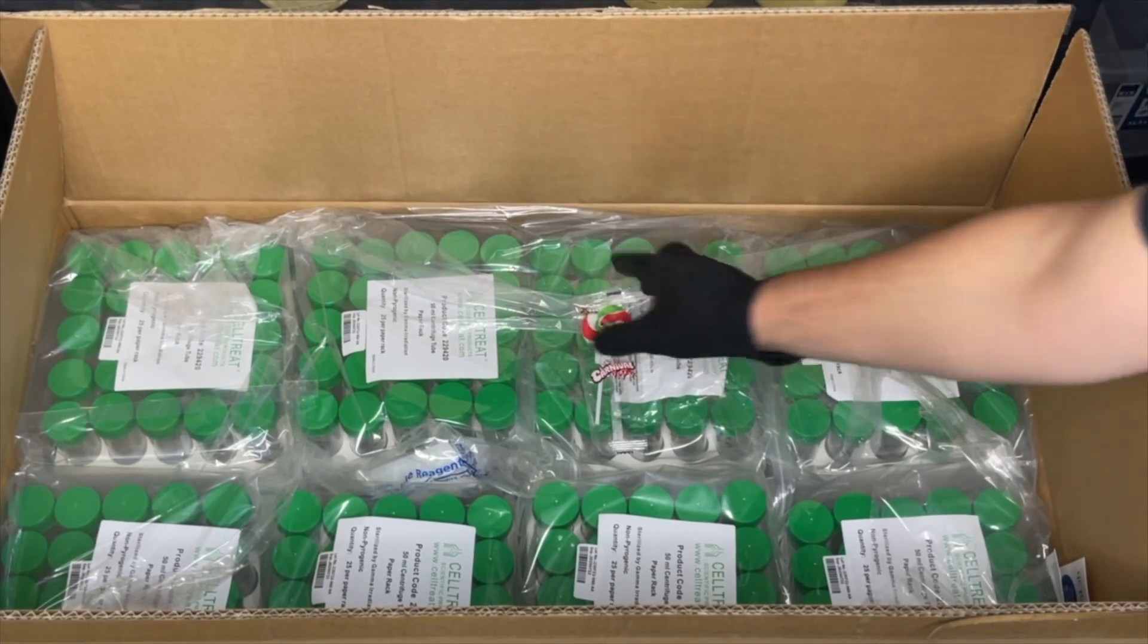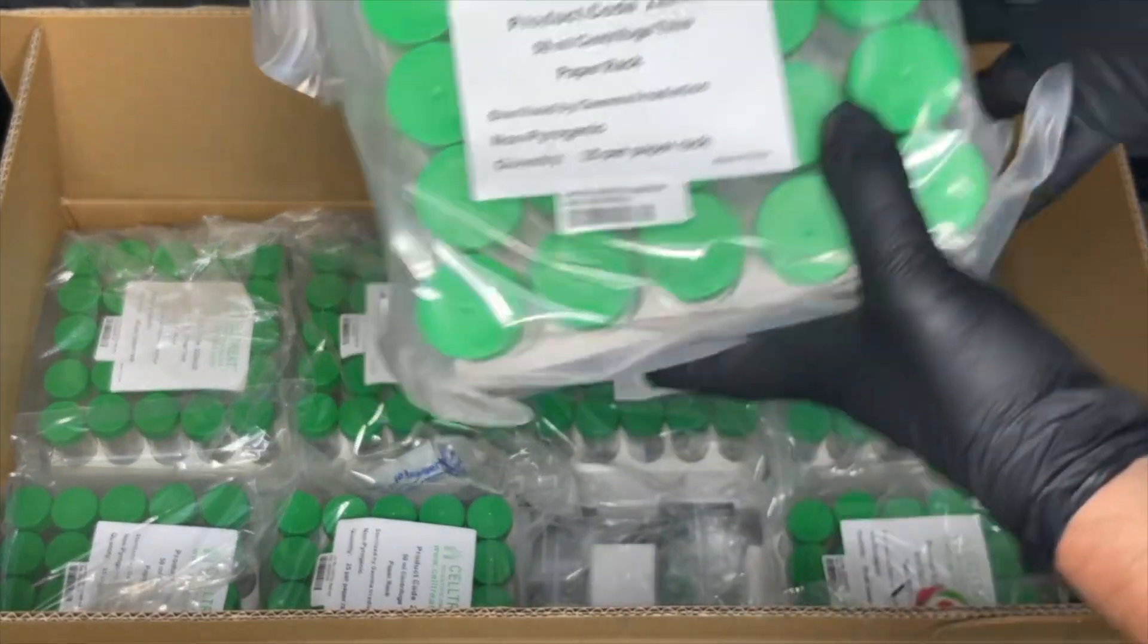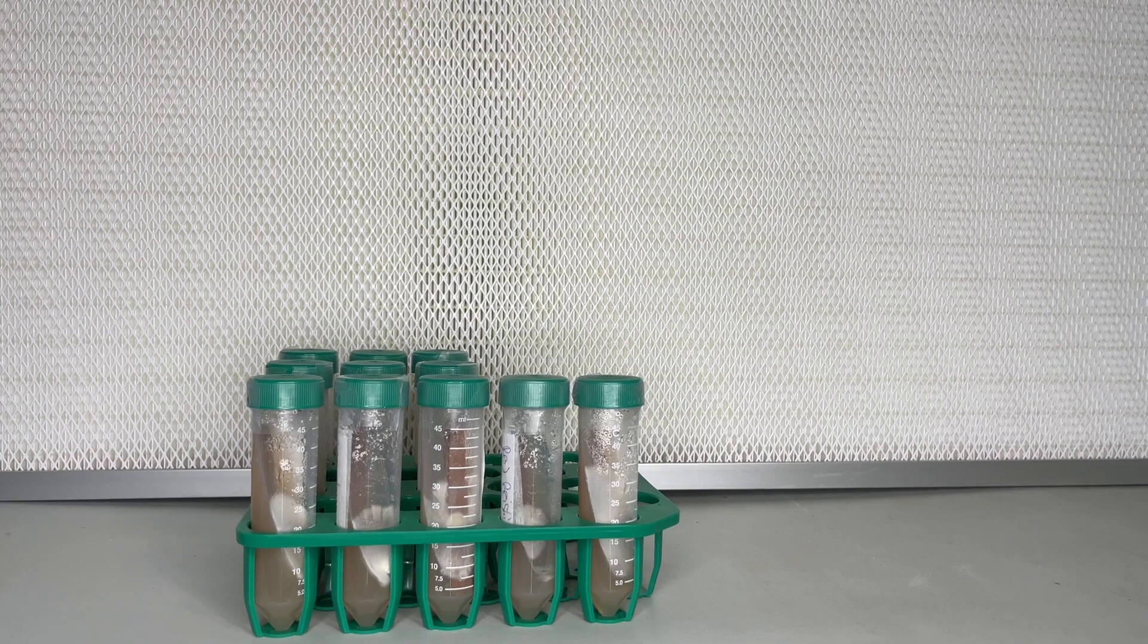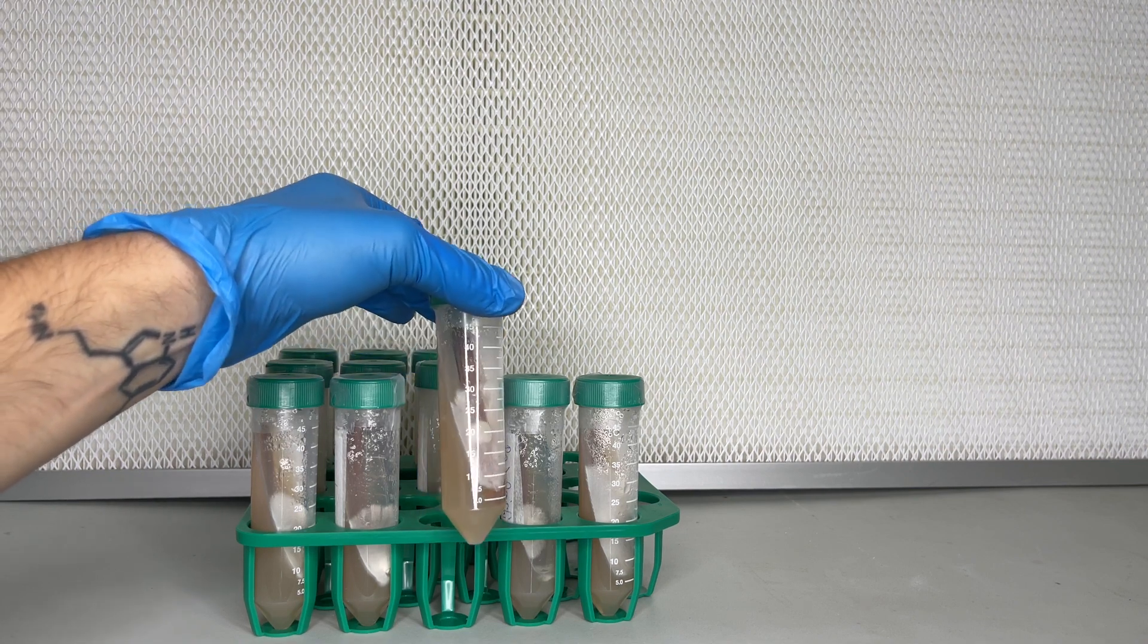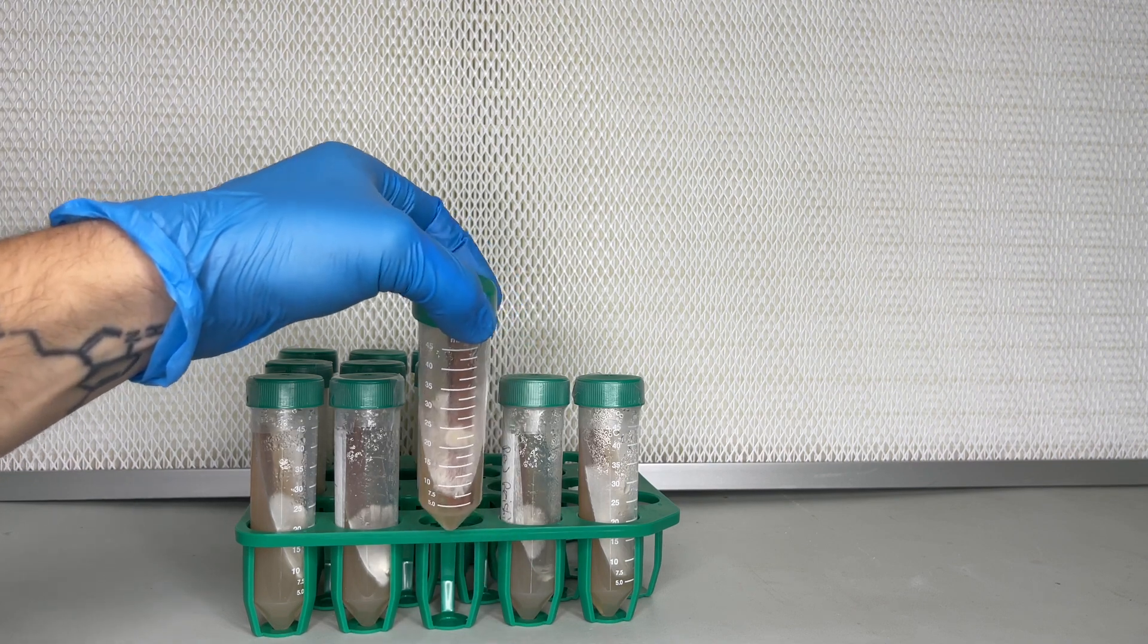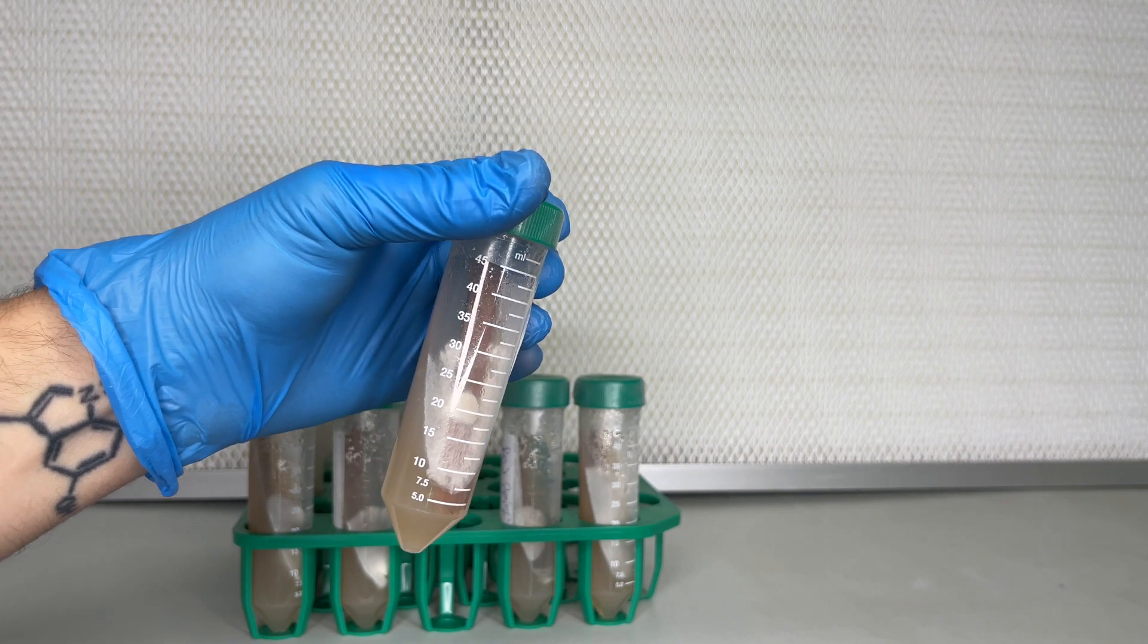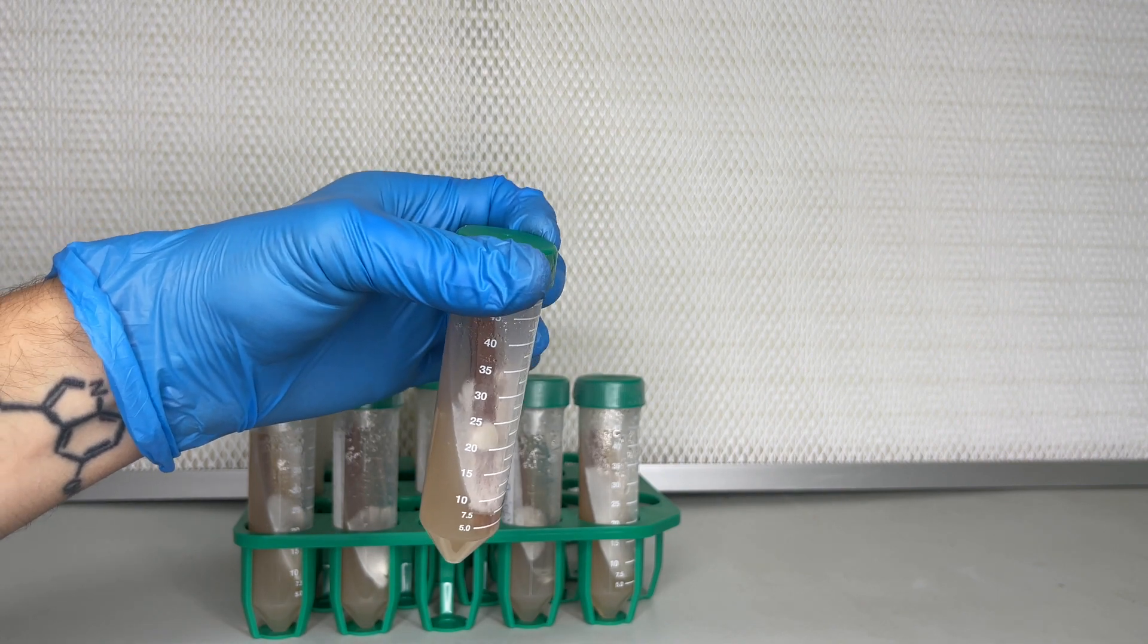I buy my culture slant tubes from a company called Celltree on Amazon. I use these to transfer my first generation mushroom cultures to for long-term storage. The agar is poured into the tubes and then they are pressure sterilized and then allowed to cool down on a slant. The agar is thicker in a culture slant than it is on an agar plate, and usually what happens with an old agar plate is the thin layer of agar starts to shrivel up and dry out, whereas the thick agar in a culture slant will last a lot longer before drying out.